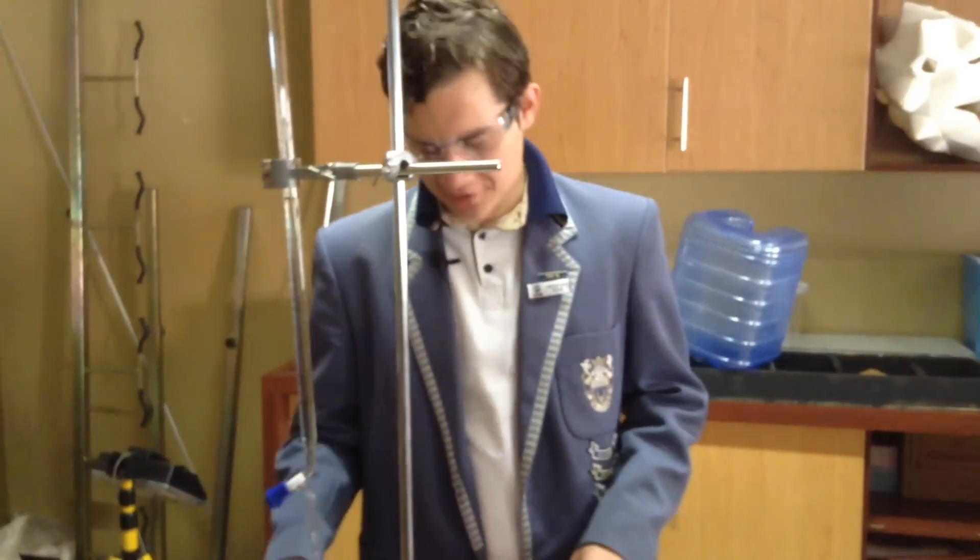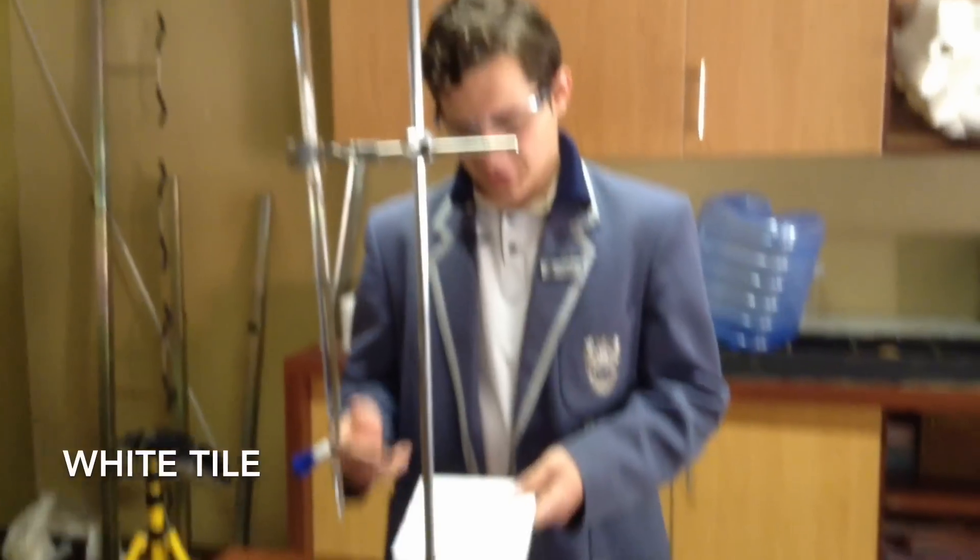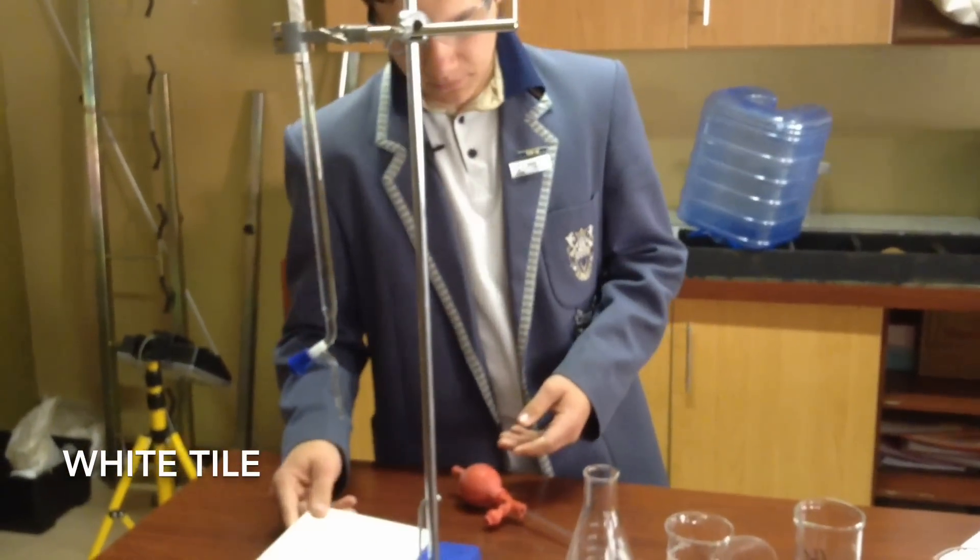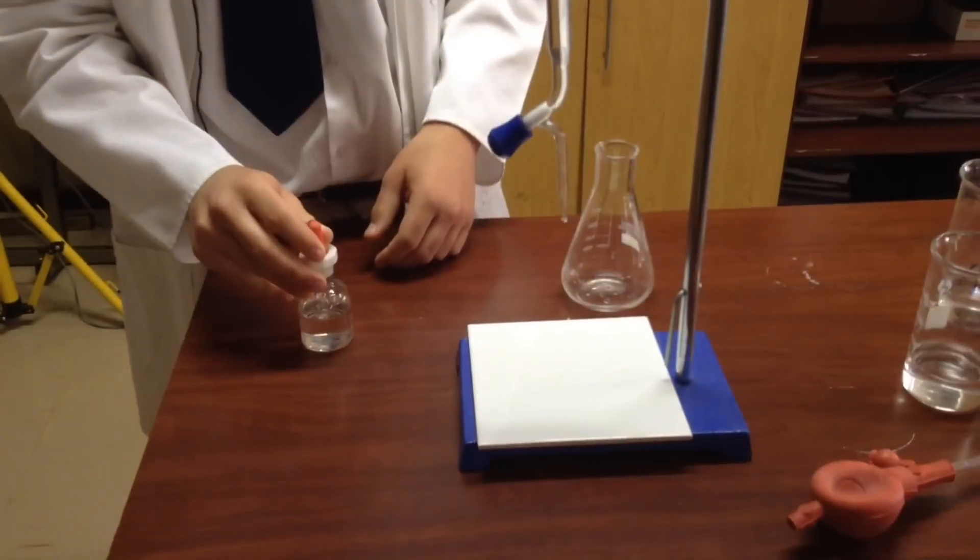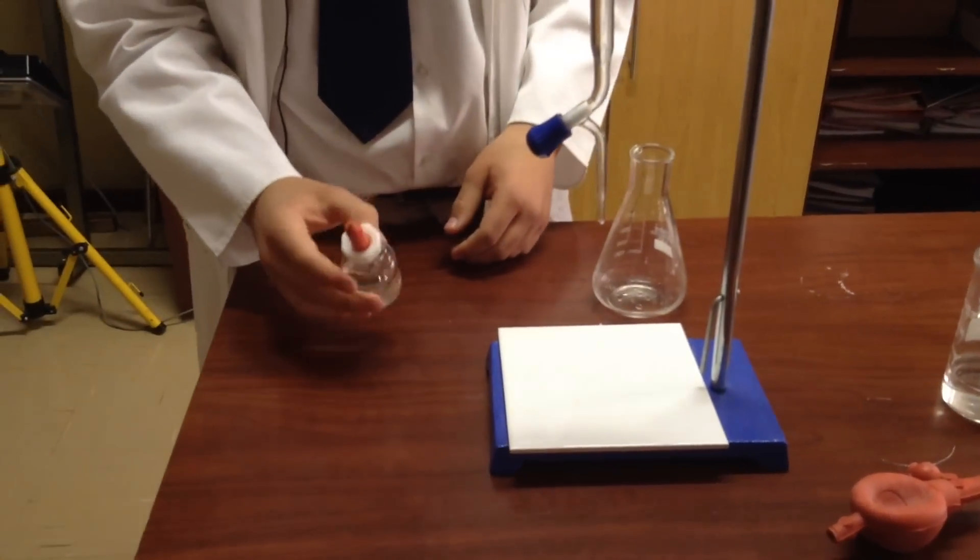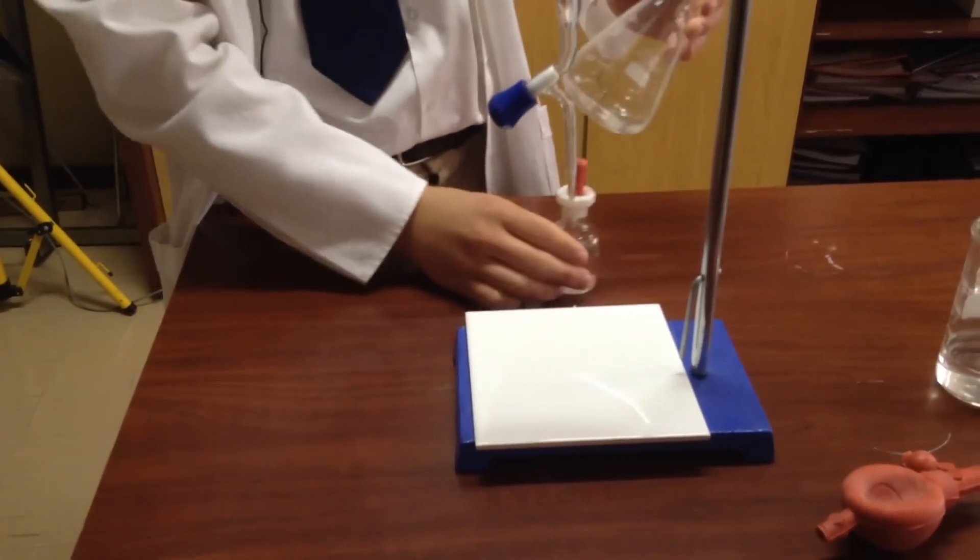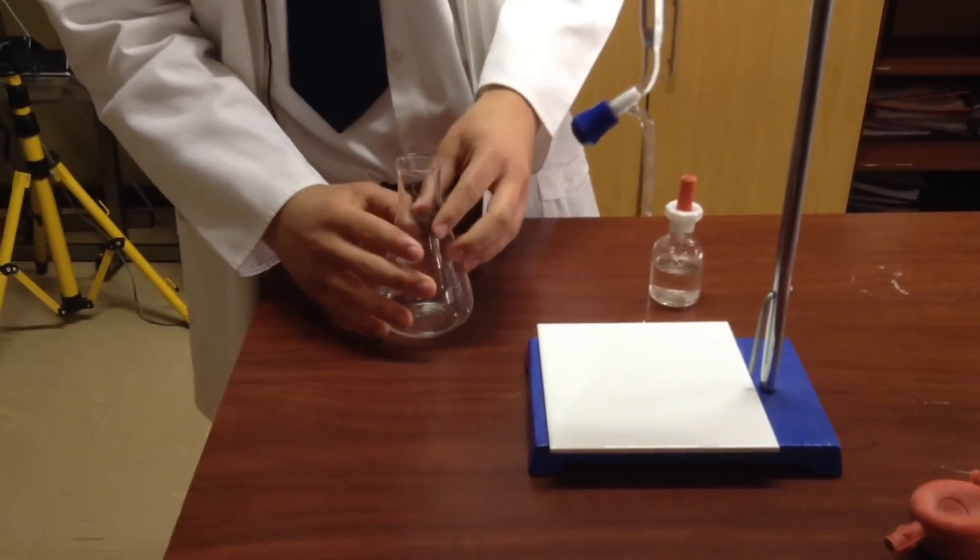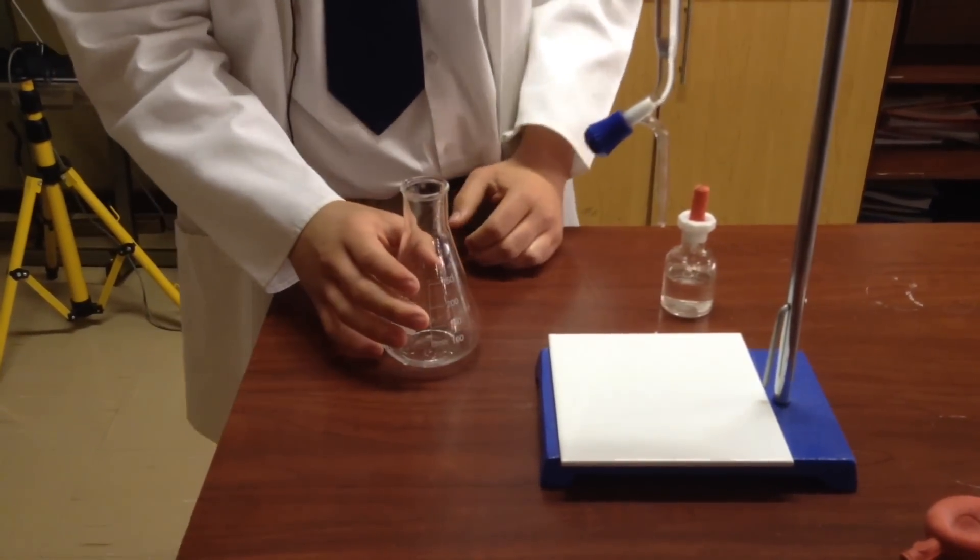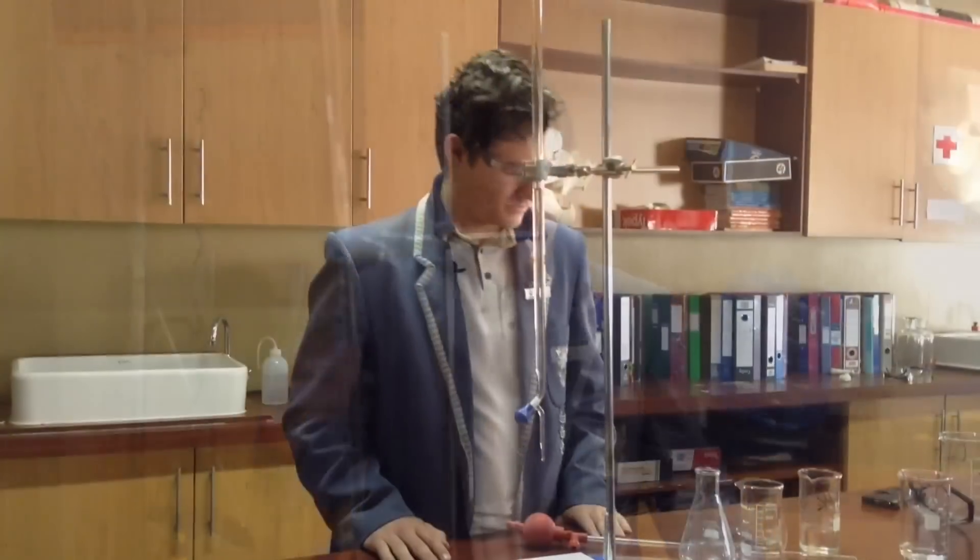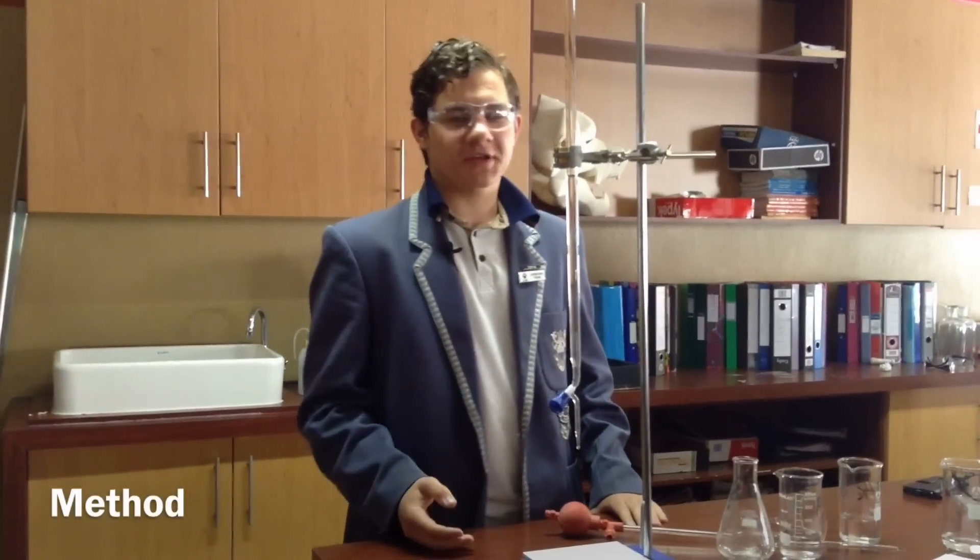And then you're also going to need a white tile, because while we do our titration we want to see the color of our results. And then we're also going to need phenolphthalein, which is going to act as our indicator. And then finally a conical flask which is going to hold our unknown solution, and finally you're going to need a retort stand to hold your burette.